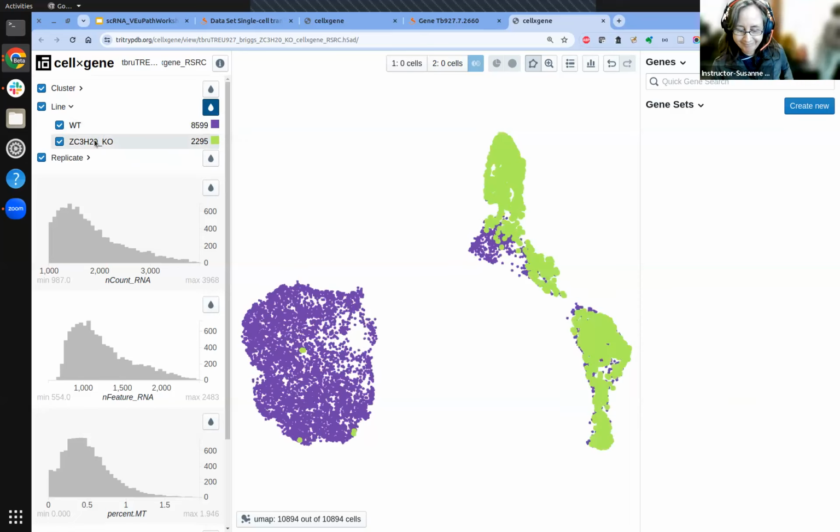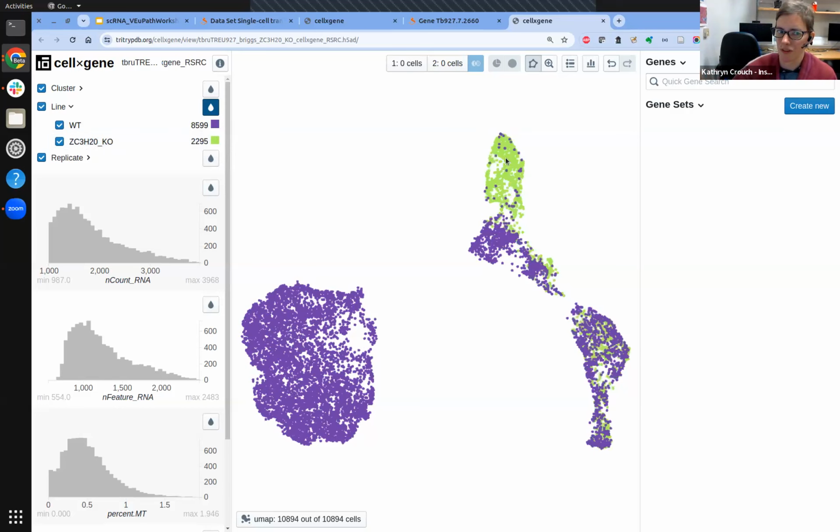By comparison, the knockout, you can see that they're sort of turning right in this UMAP. So at the beginning, they overlap with the wild type pretty well, but almost none of them become stumpies. And instead, we make this other weird population up at the top up here.